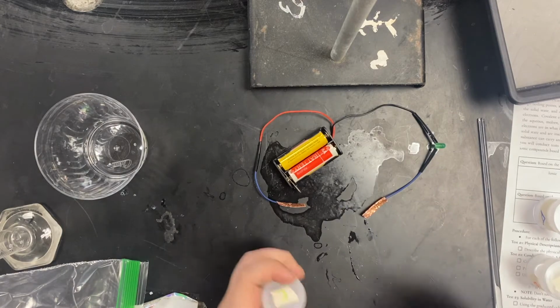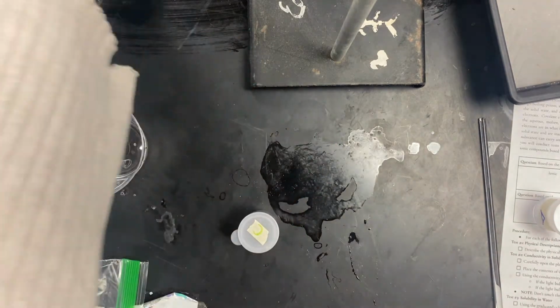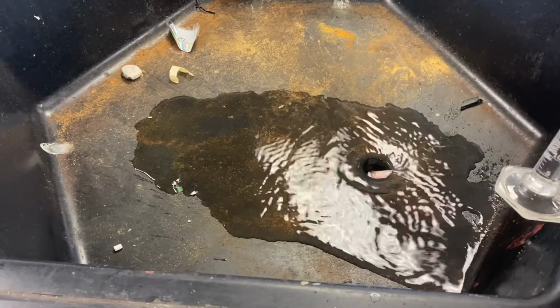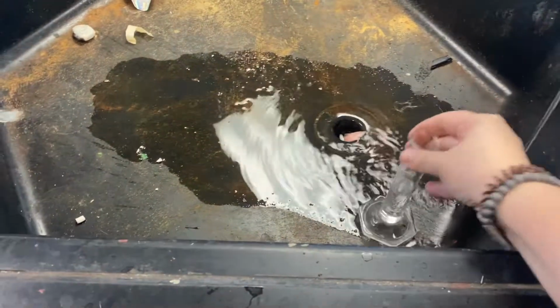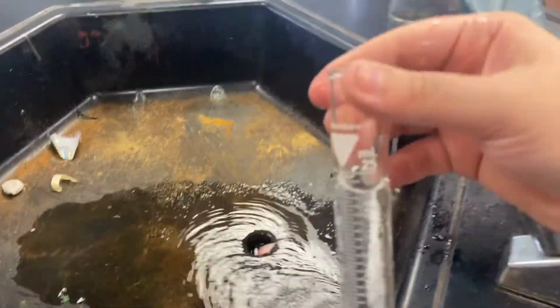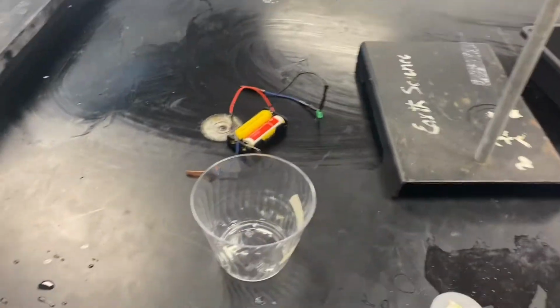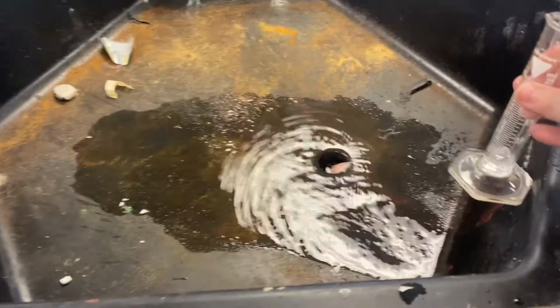Moving on to test number 3, solubility in water. You're going to use your graduated cylinder and take a trip over to the sink, and we're going to get approximately 25 mils. It does not need to be perfect. Approximately 25. We're going to pour that into 1 cup and take 25 mils and put it into our other cup.